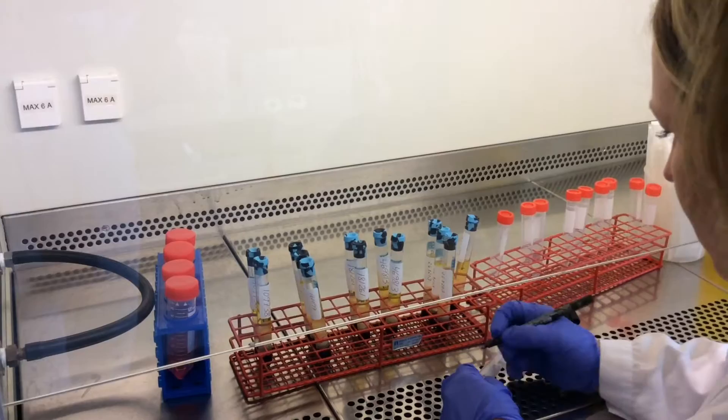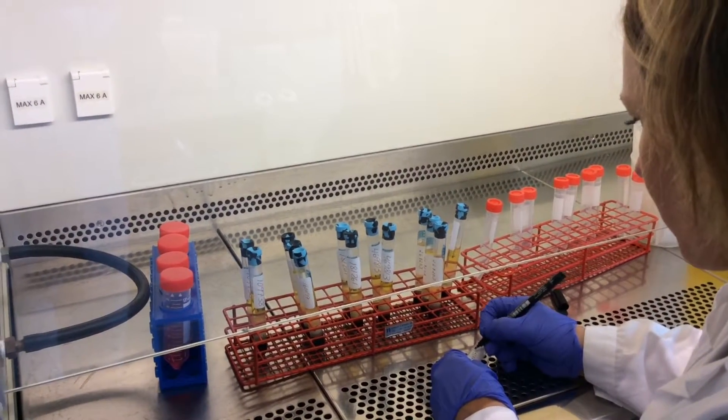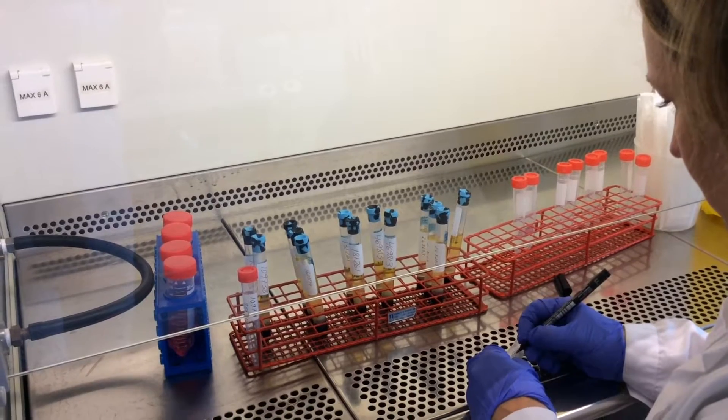Then there is a gel barrier and in the bottom are red blood cells. The red blood cells from the kids who have donated samples at yearly time points — such as eight years, nine years and so on — will be used.